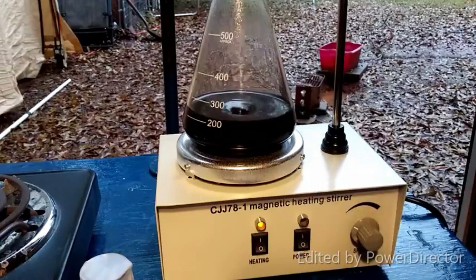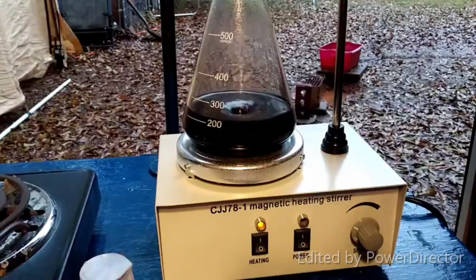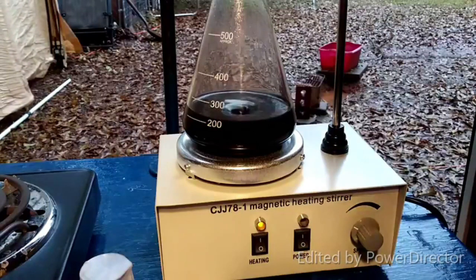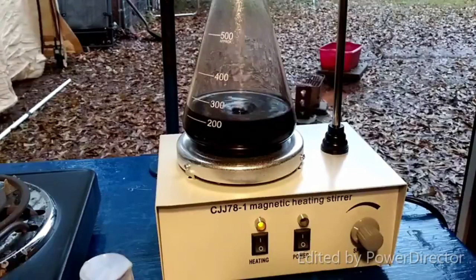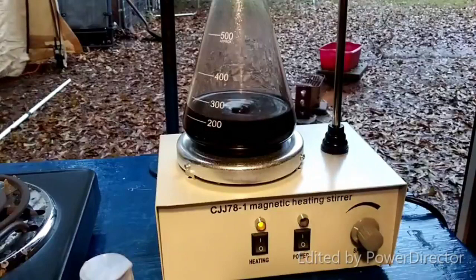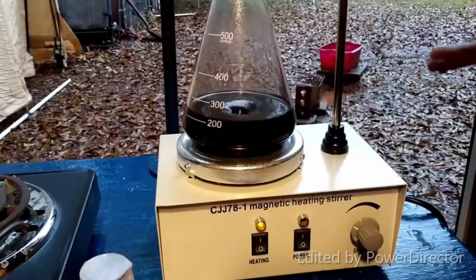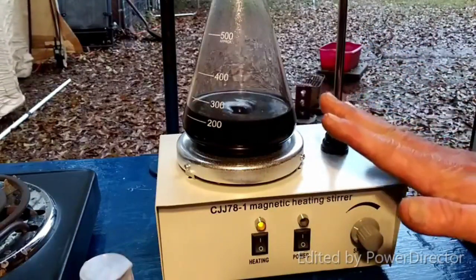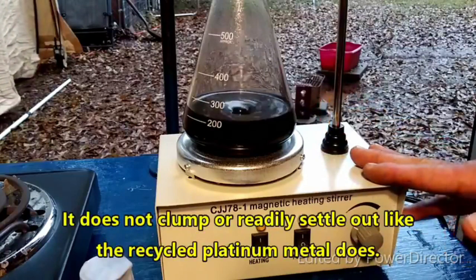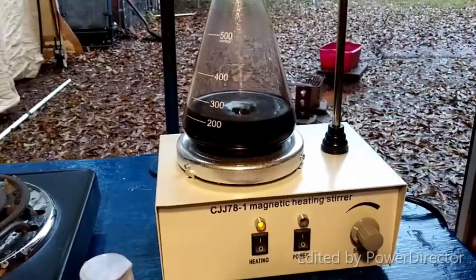Now, I knew, or at least I highly suspected, that borohydride was not going to just reduce it down to metallic platinum like before, and I was right. As was confirmed by smell, the sodium borohydride reduced the sulfite, or bisulfite, that was present in solution down to hydrogen sulfide, which reacted with the platinum to produce platinum disulfide. That is my best guess as to what this is. It is a very, very fine particulate.